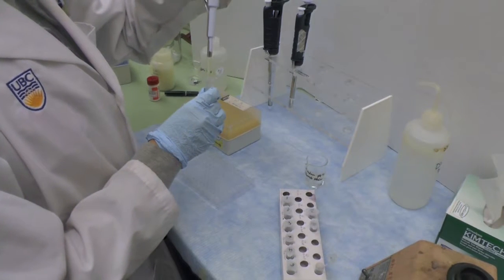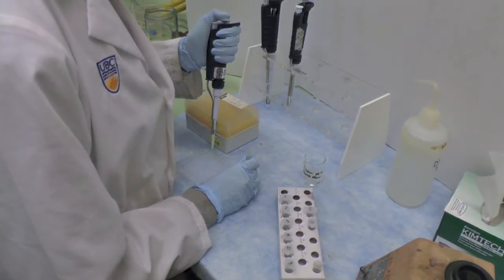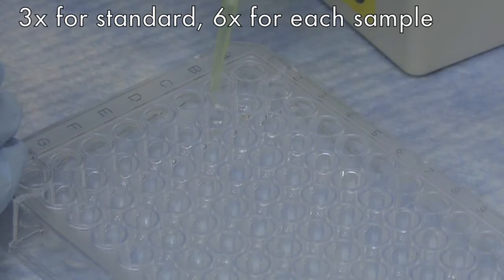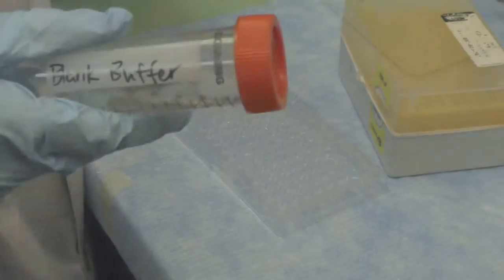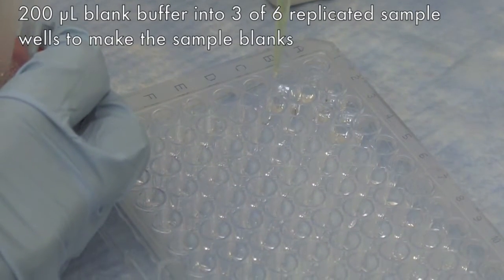Pipette 5 microliters of milk samples or standard into each well. Perform triplicate for standard and 6 replicates for samples. Pipette 200 microliters of blank buffer into wells containing sample. These will be your sample blanks.